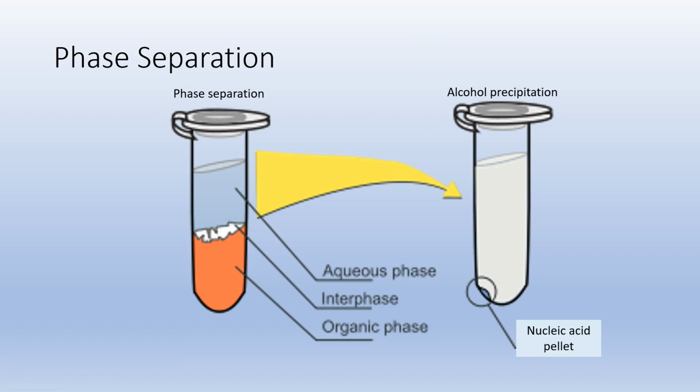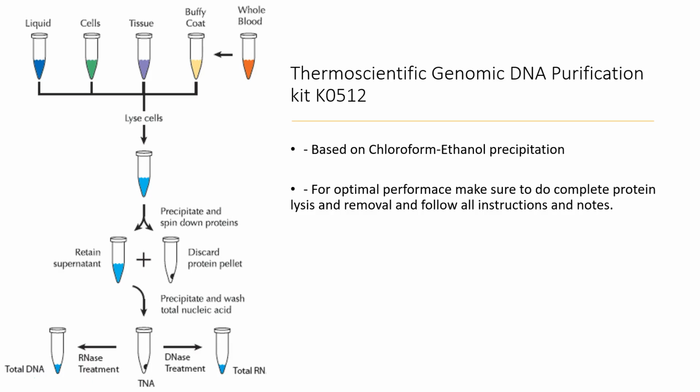Now, one thing that I have not talked about in detail is the actual lysis of the cells. To lyse the cells, you basically want to permeate the cell membrane. If you remember, cell membranes are lipid bilayers, so they have a lot of fat in them. Well, just like Dawn dissolves fat and grease from our dishes, we can use detergents to dissolve the membranes of the cells as well. Similarly, with COVID-19 or any infection, we are asked to wash our hands with soap to destroy the integrity of that membrane. So we do exactly the same thing.